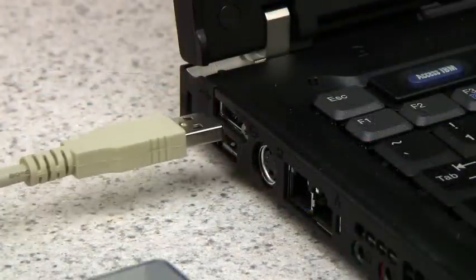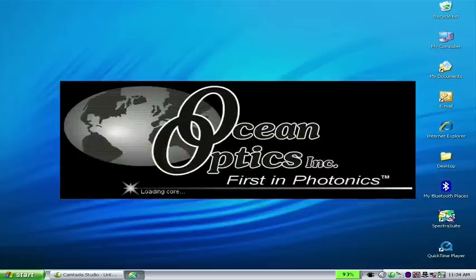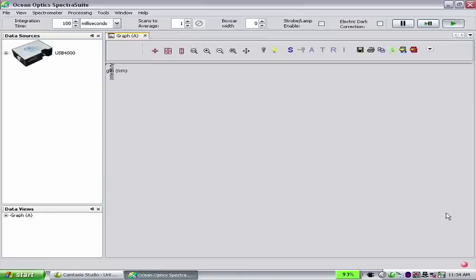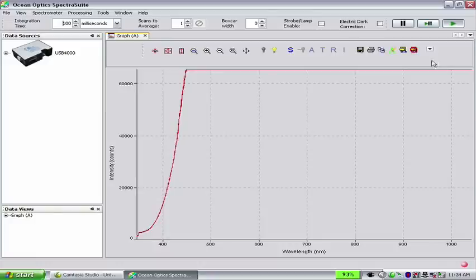When your setup is fully connected, launch SpectraSuite. You should be greeted with the SpectraSuite interface showing a picture of your spectrometer in the Data Sources pane. Now we'll demonstrate how to use one of SpectraSuite's processing mode wizards to perform a basic reflection measurement.